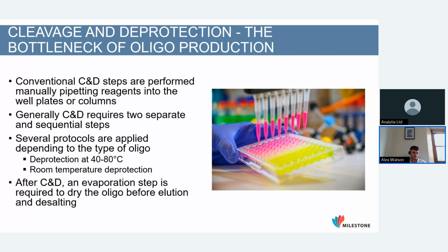Finally, just to remove that excess C&D reagent, we have to perform an evaporation step. So this is done after C&D is performed, before we can elute our oligos from the solid supports.